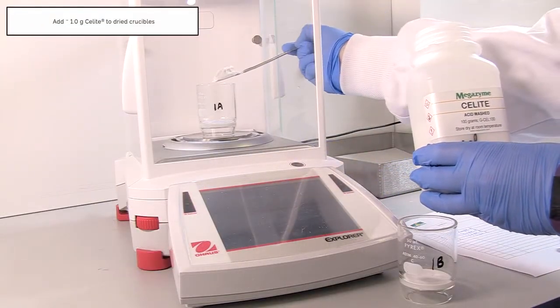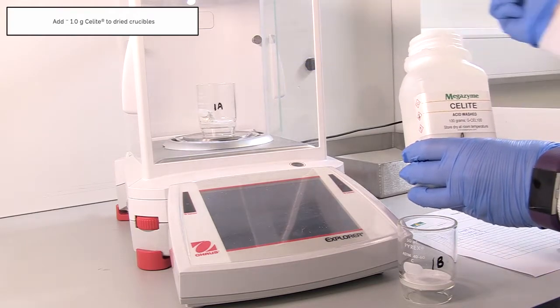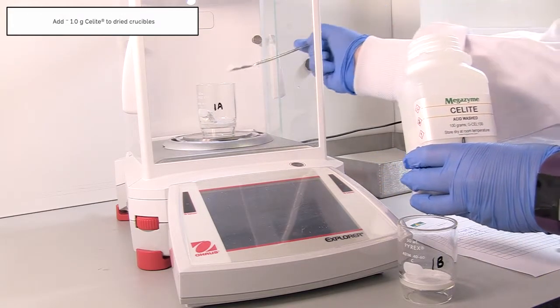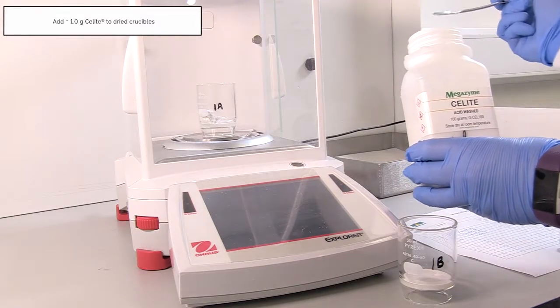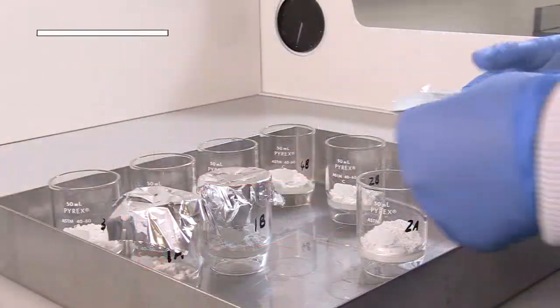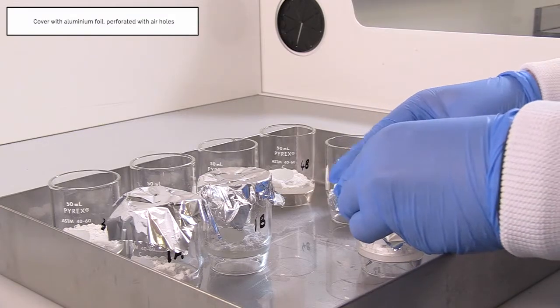Add approximately one gram of celite to dried crucibles. Cover with aluminum foil perforated with air holes.